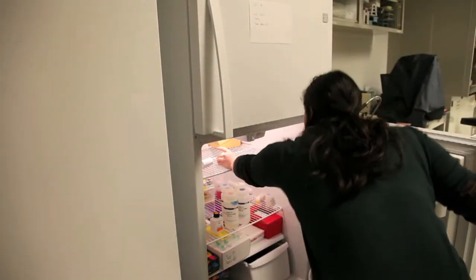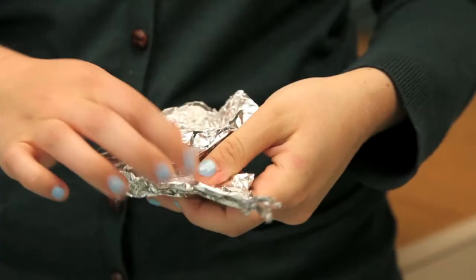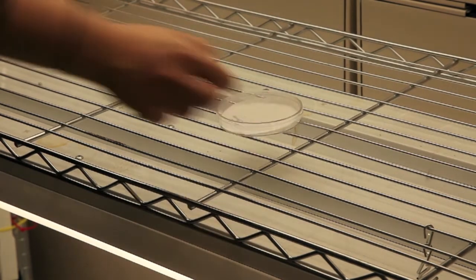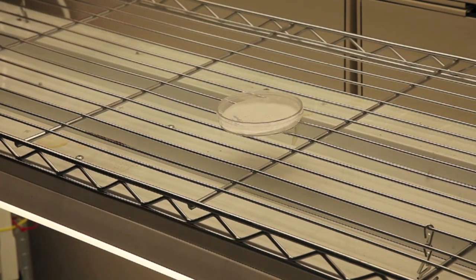After stratification, remove your plates from your refrigerator or cold room, unwrap them and place them in the light. This can either be a special light rack or your classroom desk. Make sure to write down the day you took out the plates. This is day zero.